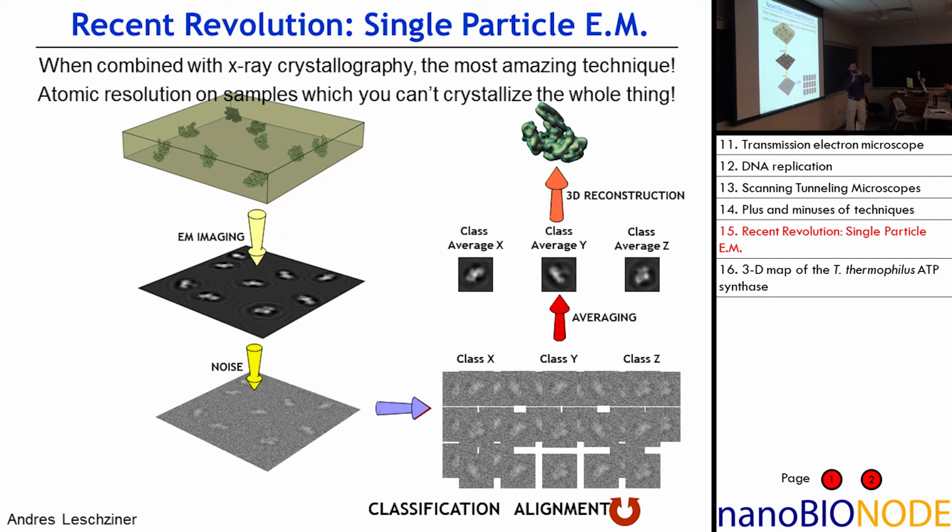They manage to get three-dimensional reconstruction because sometimes, it's here and it's here and here. They separate them, get the average, and they say, okay, average, let's say, and the X is there, and then the Y is there, and the Z, and they can do it.